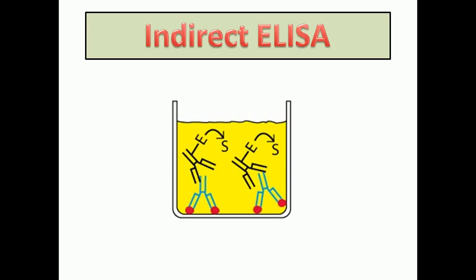In the laboratory we can add different varieties of antigen in different wells to produce different specific reaction kits. This process is called indirect ELISA because the primary antibody that we use is not enzyme linked. The secondary antibody is enzyme linked, and it is the anti-primary antibody.